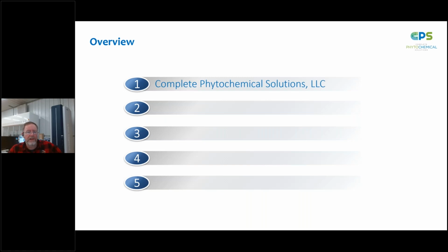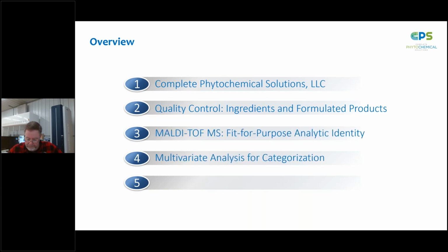Give you a quick introduction to Complete Phytochemical Solutions, who we are and what we do. Talk a little bit about the quality control issues in the decision making on procurement of good quality botanical ingredients, and the qualification of unique formulated products. And this could be formulated blends and all the way up to a retail finished product.